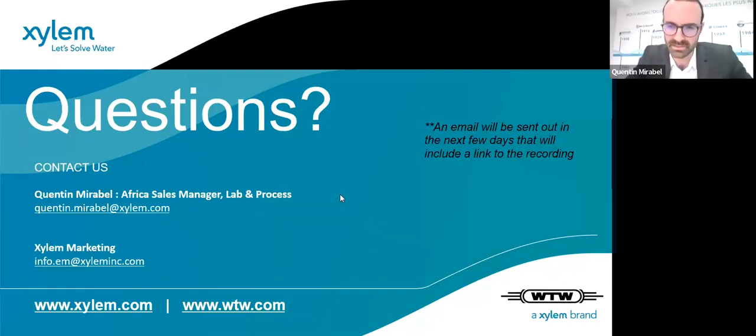For example, I'm based, as I said in my introduction, in Africa. And you know that water scarcity is very important there. We do have applications for desalination, water reuse, etc. You need to measure continuously what is going on in your process, and in desalination plants this is very important. It's becoming very important, especially in Morocco and Egypt, for example. So to answer your question, yes, we do have applications in desalination plants for other measuring parameters, either in the lab or on online measuring systems.